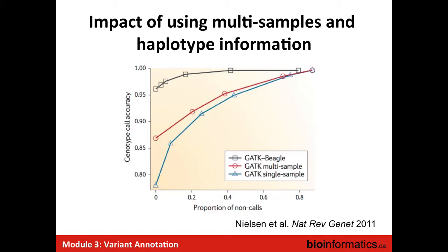So how do you tell the difference between a duplicate and actually two independent reads? It's usually based on the fact that it's exactly the same start and end. If they have exactly the same sequence, those reads get pulled out. They get marked as duplicate and then they just get counted once in this calculation, because you're weighting the observation, right? So it just gets a weight of one in this case. And then, typically, if you have relatively high coverage, you won't trust single reads that are saying that there's a change here.